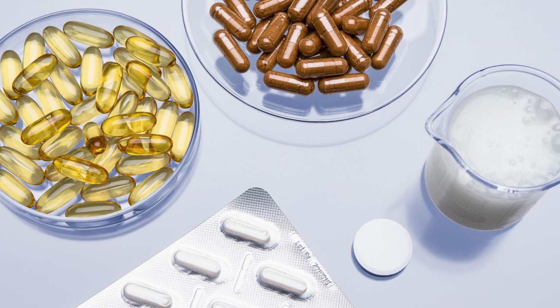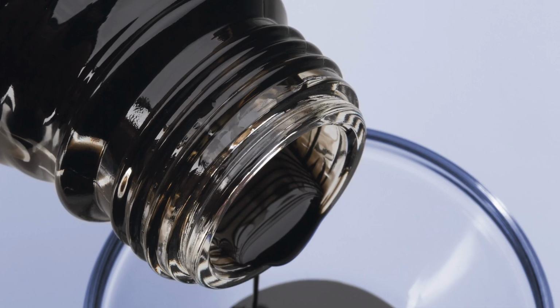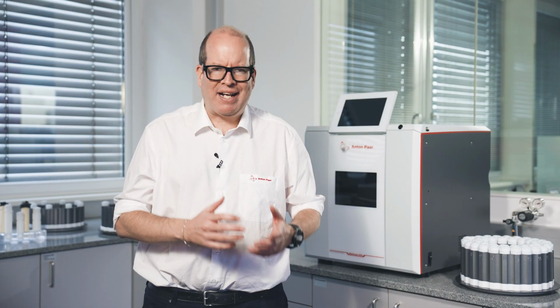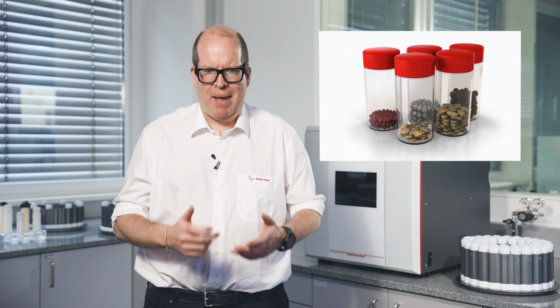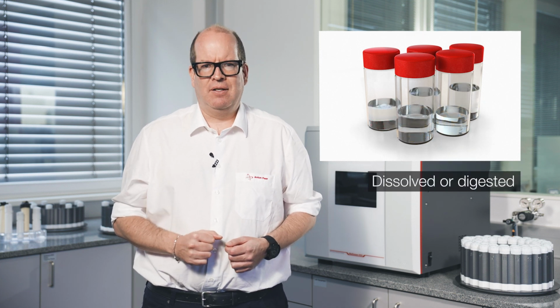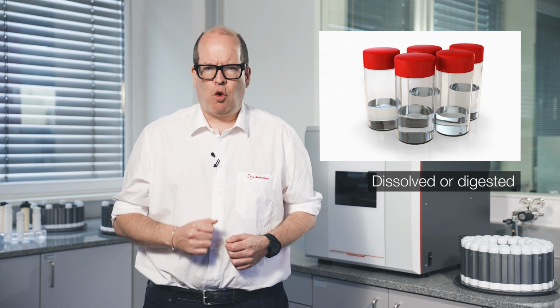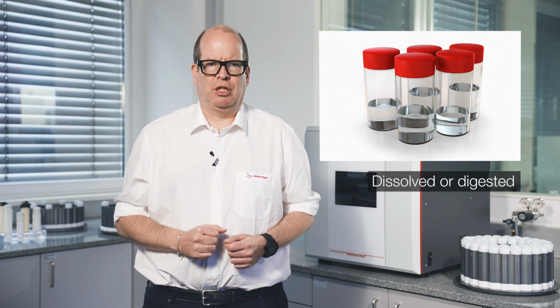Solid samples can range from food, pharmaceuticals, polymers and metals to minerals, alloys and petroleum. Whatever you want to analyze first needs to be prepared. That means dissolved or digested. The result is a clear, particle-free solution in which all analytes are in solution.